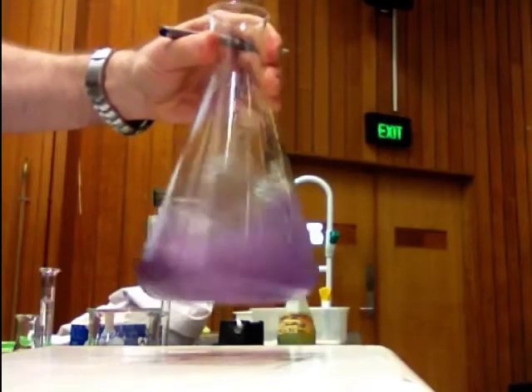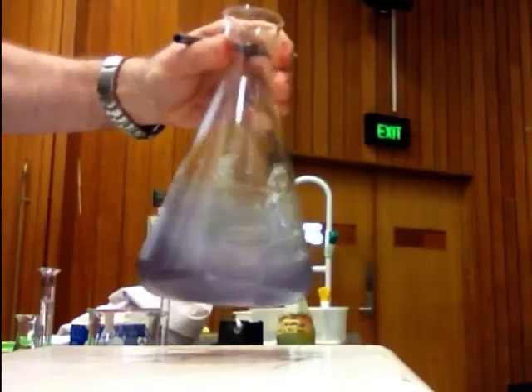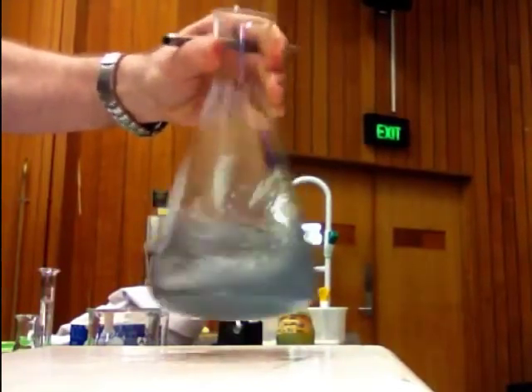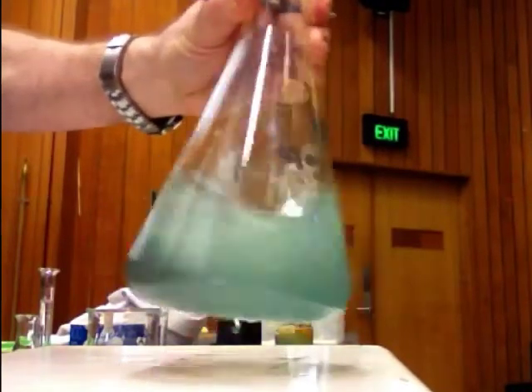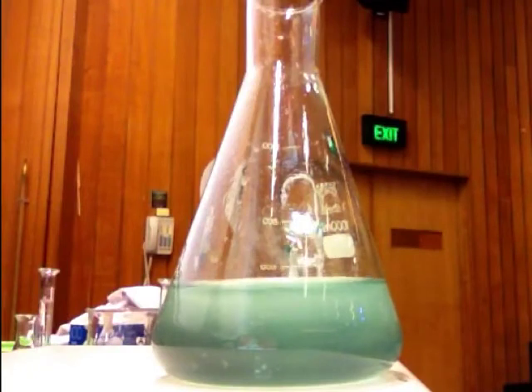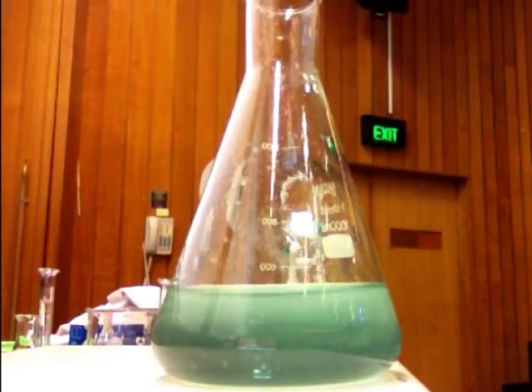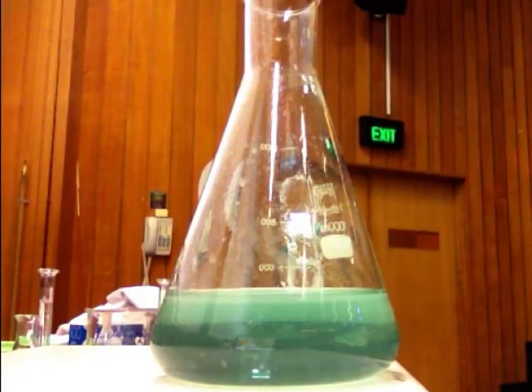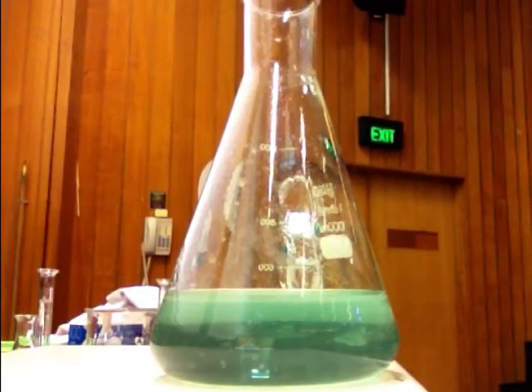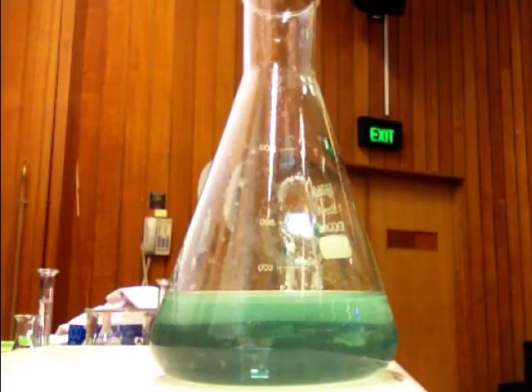So we started off with a pink color. And we've now got a green color, and that green color is MnO4 2 minus. How many D electrons has MnO4 2 minus got?